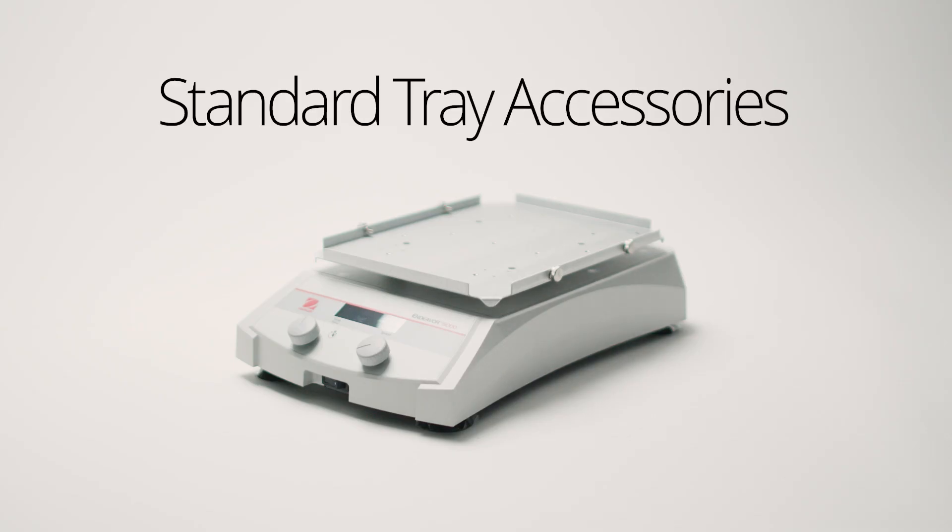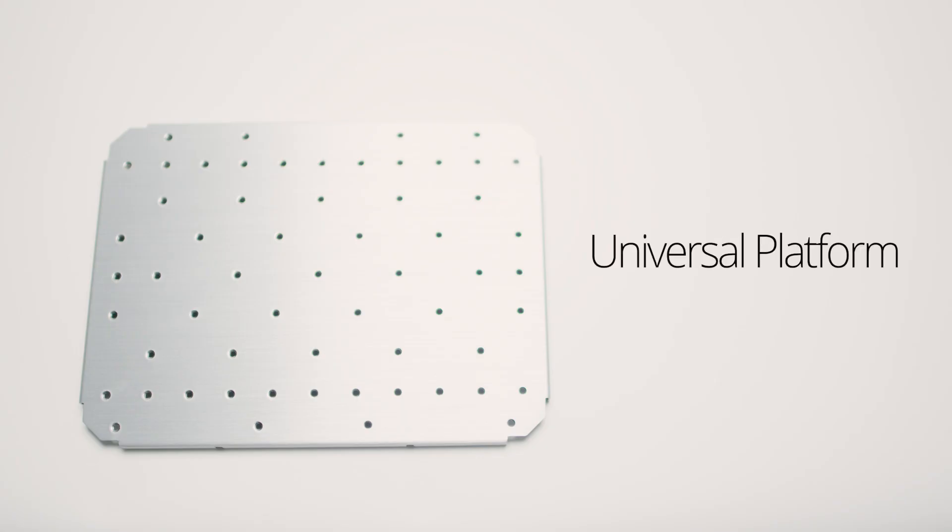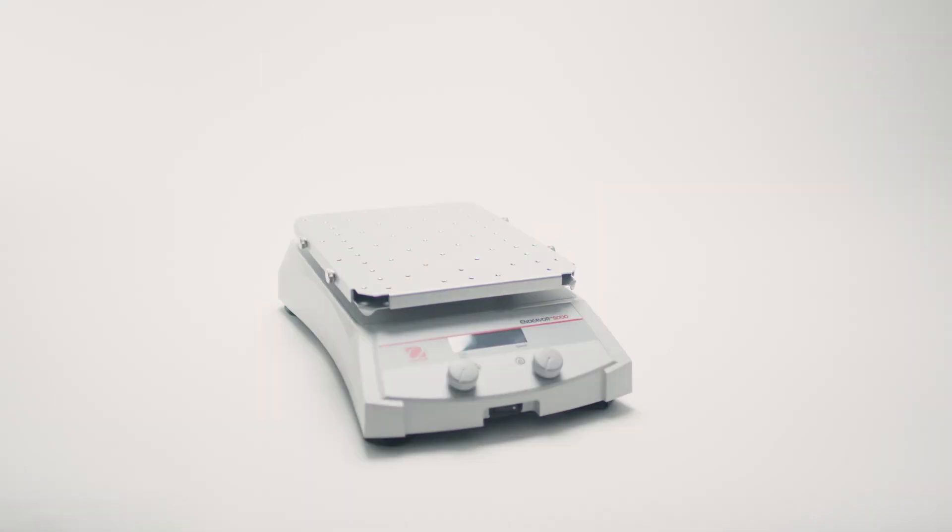Want to customize your shaking experience? The universal platform transforms your shaker into a versatile workstation.